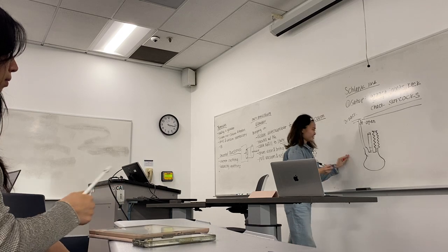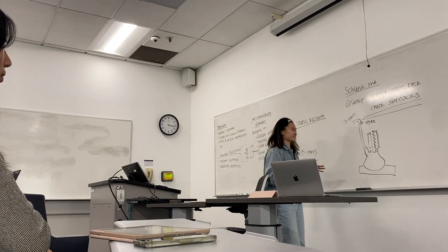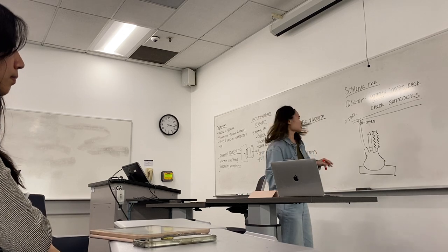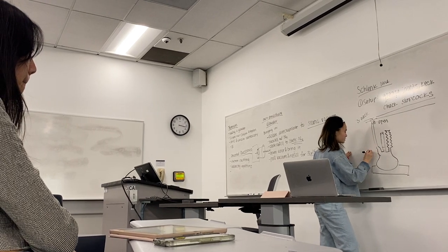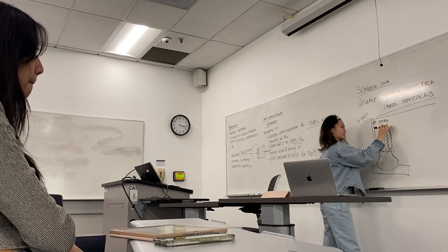And then this is your 3-neck flask. And this is your stir plate. Okay. I think that's close enough. So this is your, I can't draw an N2 inlet. Stopcock. And this always had an adapter.